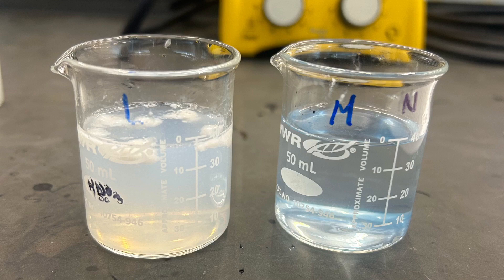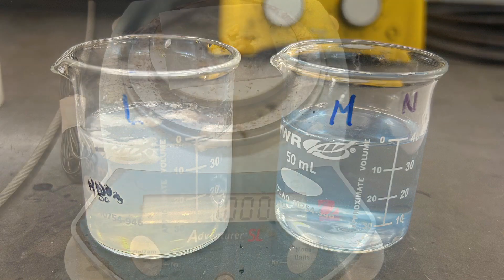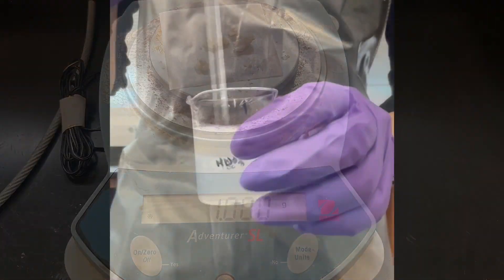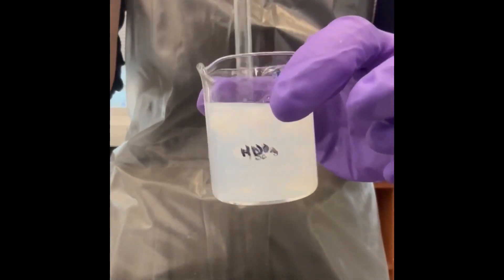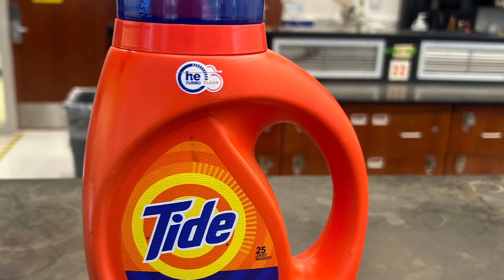Lastly, for Part E, we will determine the properties of soaps and detergents using a pH and hard water test. Using two 50 milliliter beakers, prepare two solutions. One with one gram of sodium soap you prepared in Part C dissolved in 40 milliliters of DI water and one with one milliliter of commercial detergent in 40 milliliters of DI water.